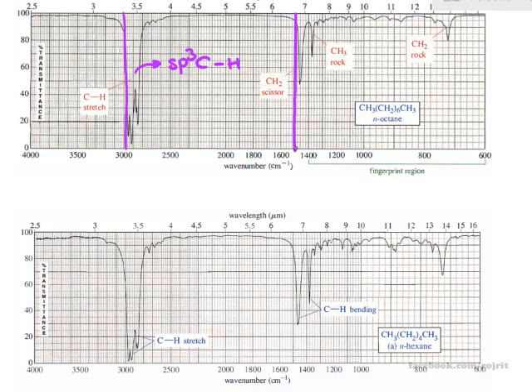Next is n-hexane. As you can see, we cannot distinguish between n-hexane and n-octane because the chemical bonding in the structures is almost exactly the same. So we cannot use this technique, IR spectra, to characterize the differences between these two compounds. We need something else, actually NMR, which we are going to talk about later.